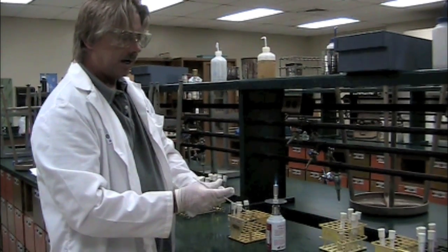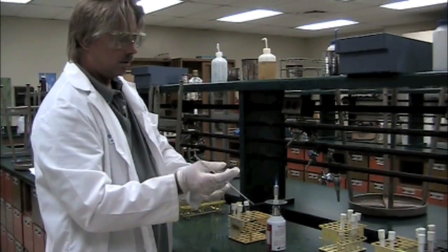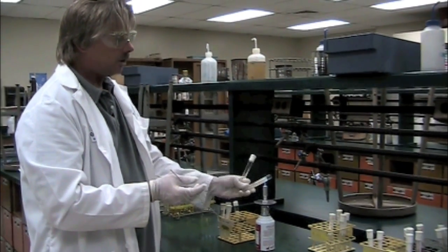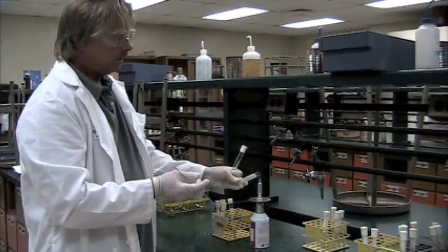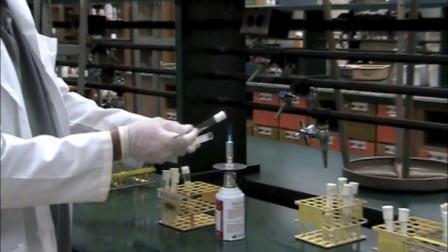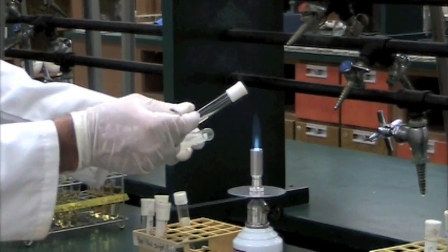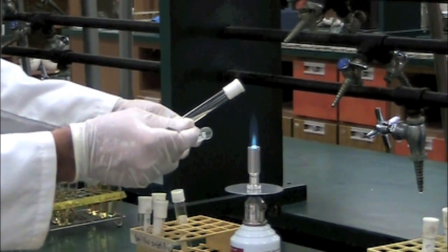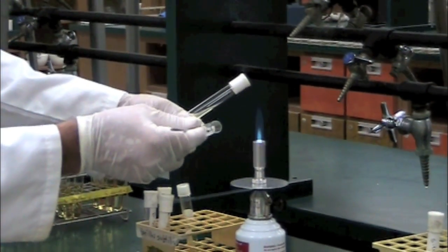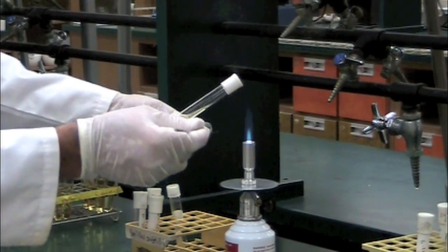I'm going to uncap my organism, and now any bacteria that is somehow around the lip of that tube is now dead. I've just flamed it. Also, the same principle applies. This glass tube is now hot, and any air current is being forced away from it. So any bacteria that's likely to be in this area would more than likely fall away.